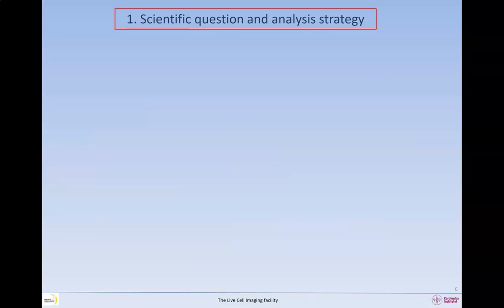As I mentioned above, how you will analyze the images should be the core of your experimental design. Define very clearly what you want to measure and where. Let me give you an example.